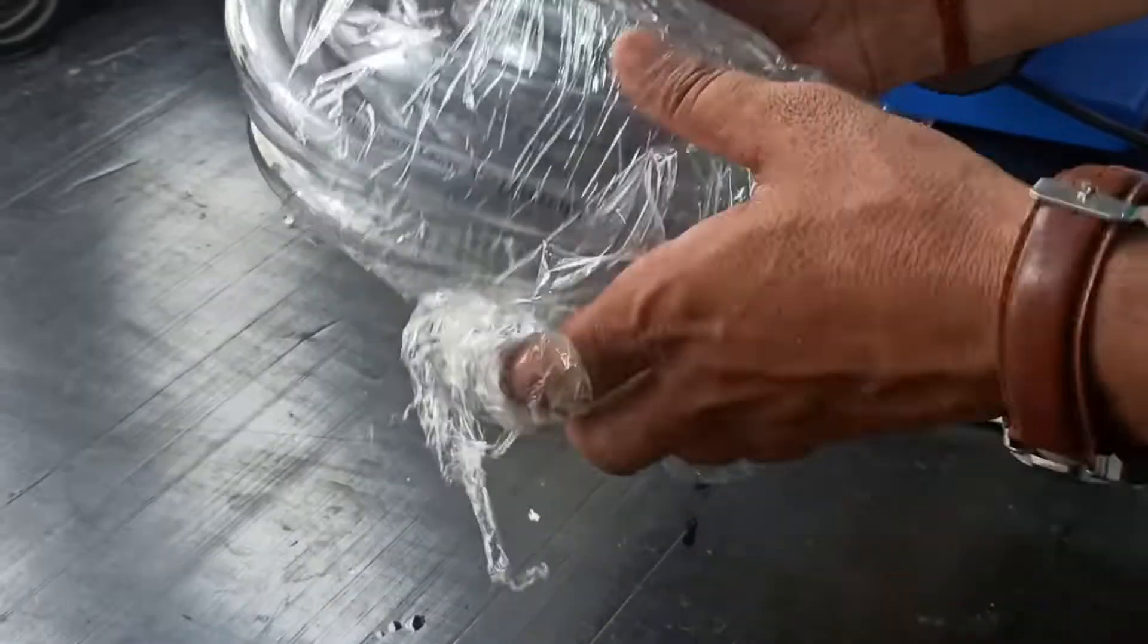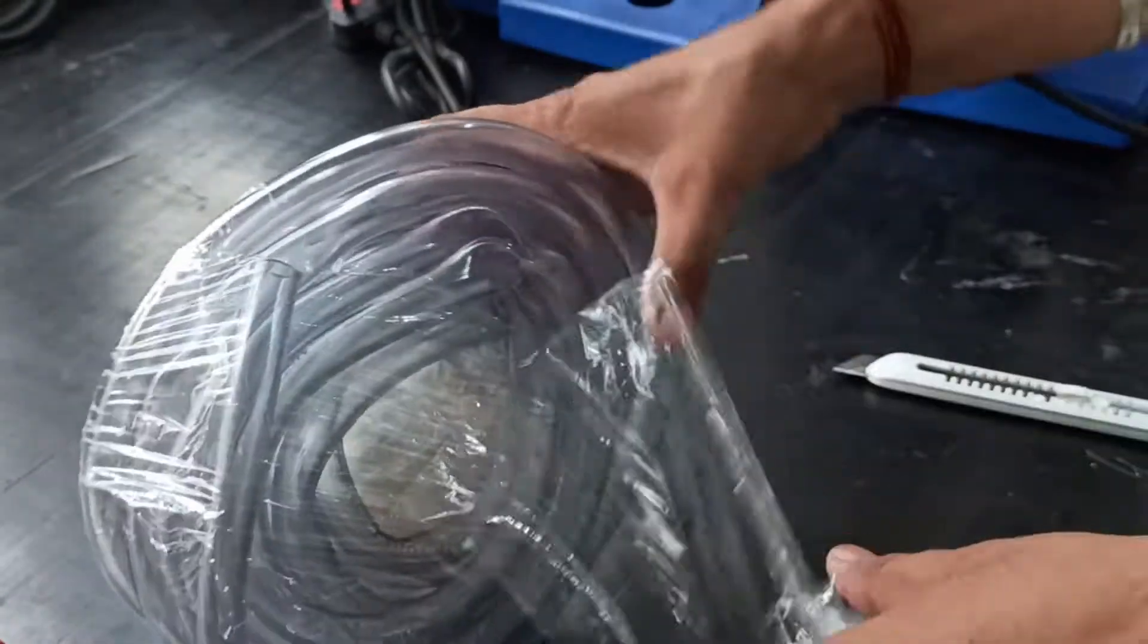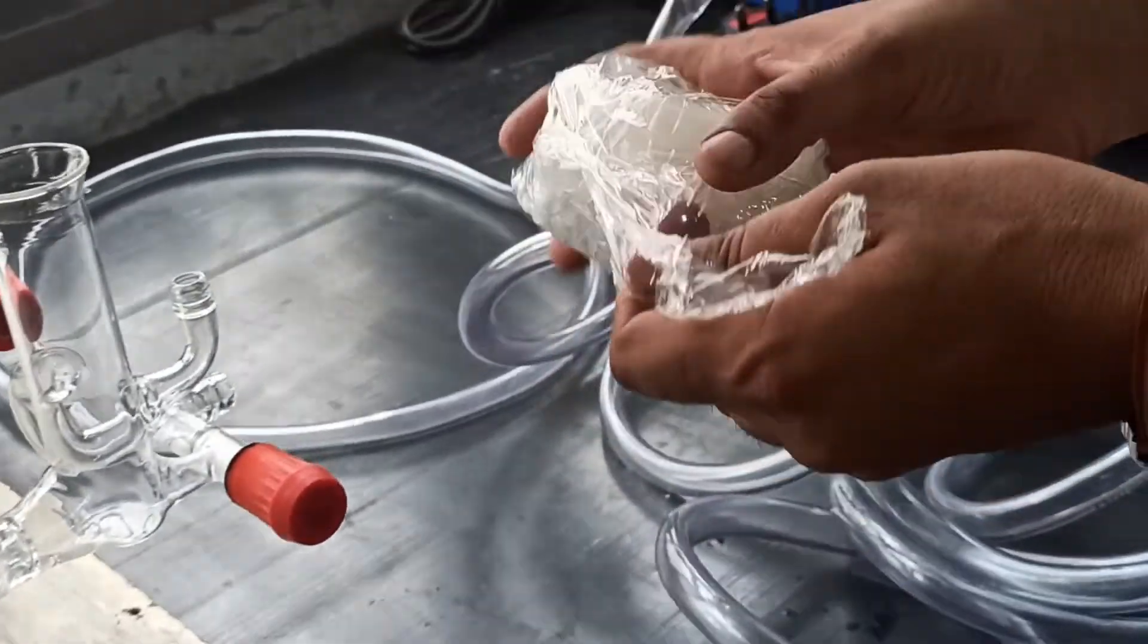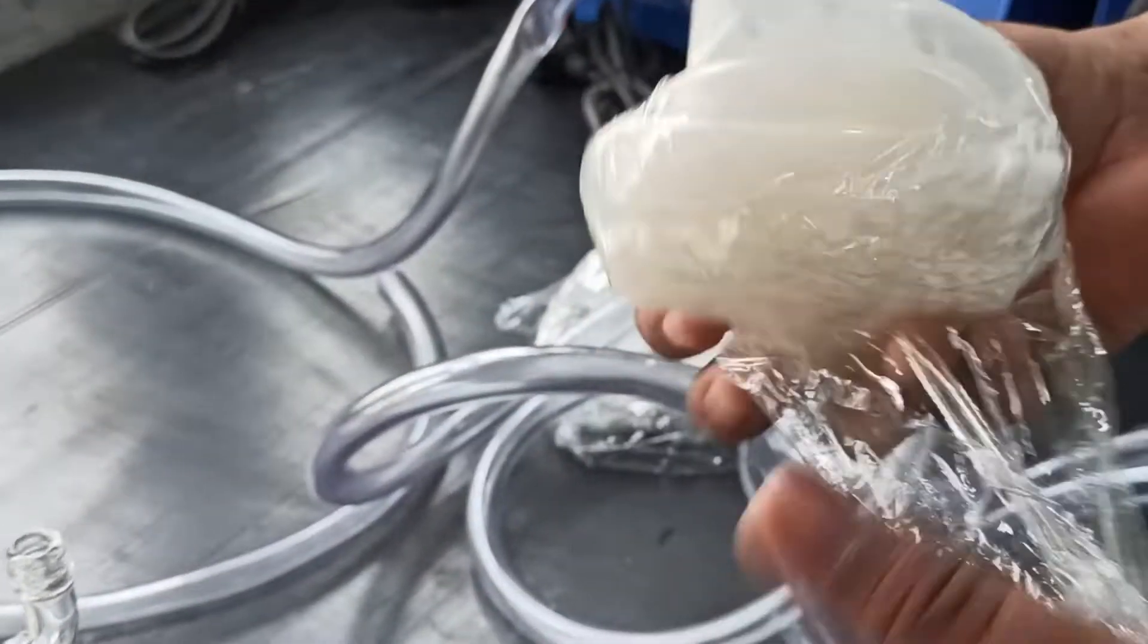You will get two types of pipes inside the packing boxes. One is transparent pipe and the second one is white pipe for distilled water output.